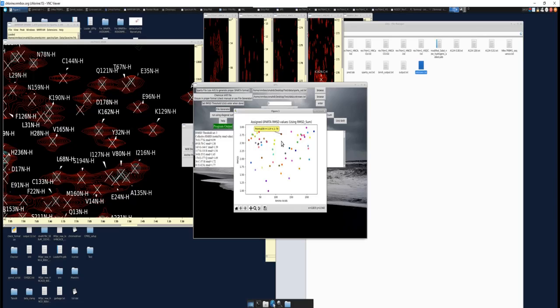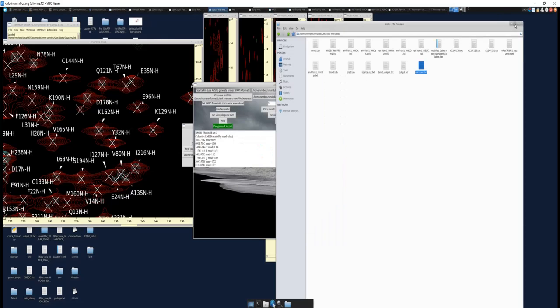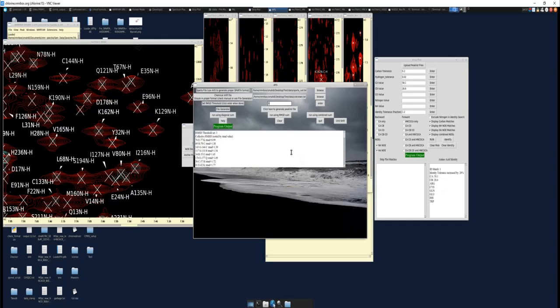As would be expected, because this is only 2 pairs, you're going to get a lot of matches. But now we can use the identifier that we have here. As we stated earlier, we know we're going to have basically this list followed by the exact same list. So the I-1, I+1, both of them must be an arginine, cysteine, glutamine, glutamic acid, histidine, tryptophan, or lysine. So we can see our very first match, 76 to 77. That's good. That makes sense. 69 to 70, right? So you have a histidine and a cysteine. That also matches what we have here.